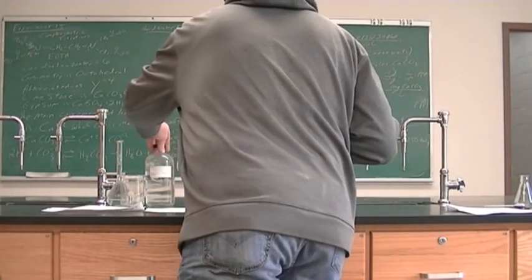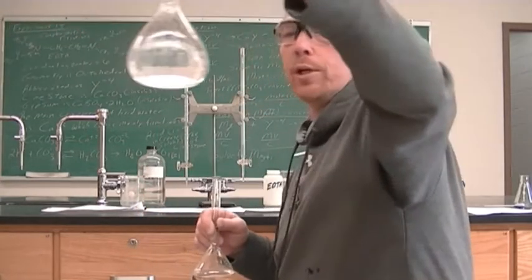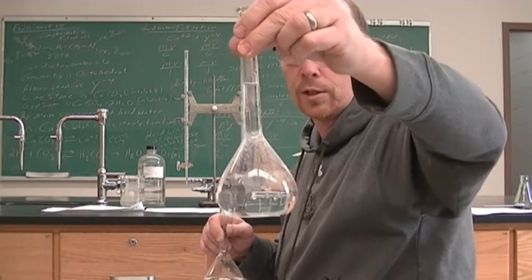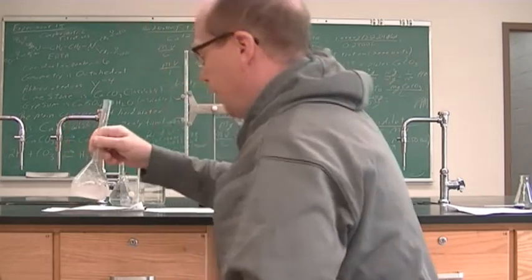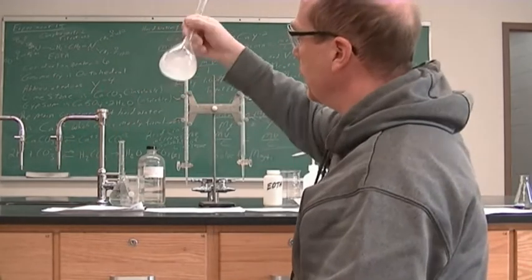I pipetted out 5.00 milliliters, put it in the volumetric flask, and then filled it to the mark with deionized water. And so I am ready with my unknown.